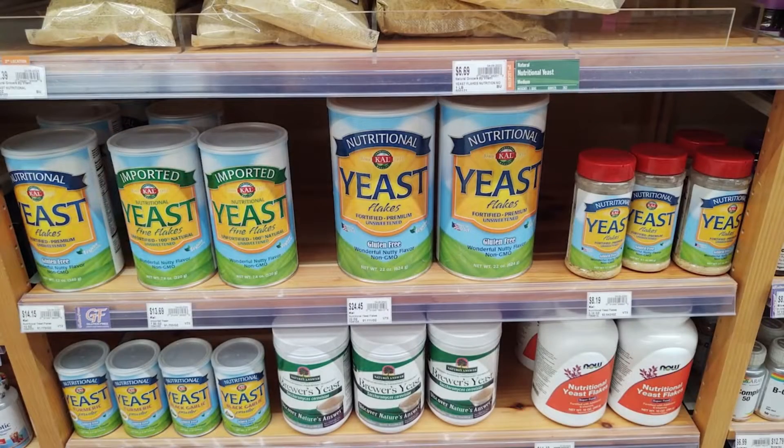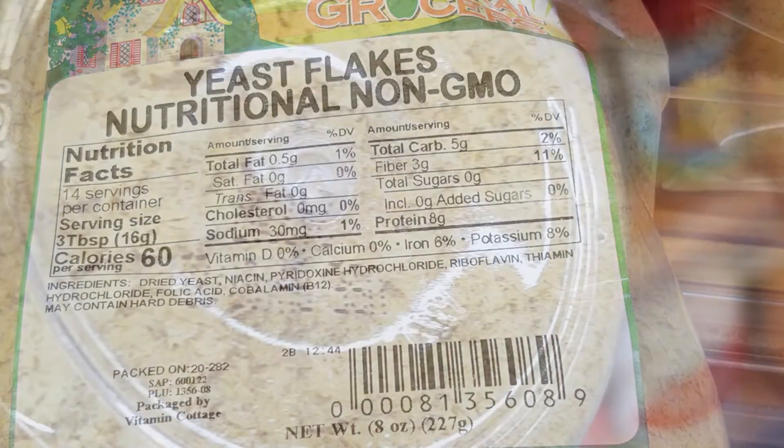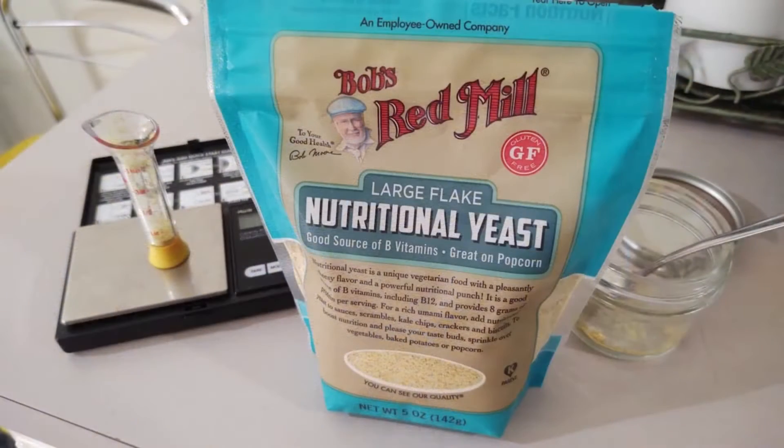Nutritional yeast can be found in most health stores or online, and comes in various forms from powdered to large flake. Both of these are good, but you do want to make sure you grind it to as fine of a powder as you can.